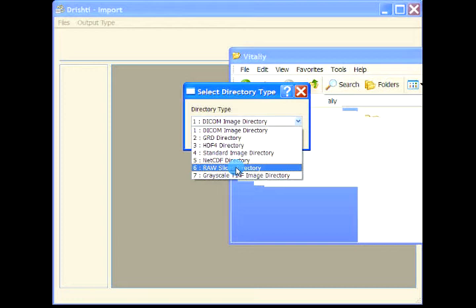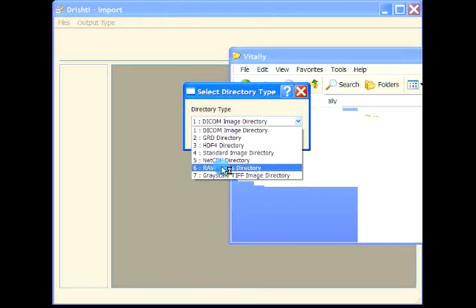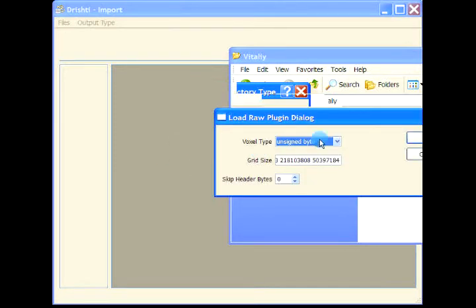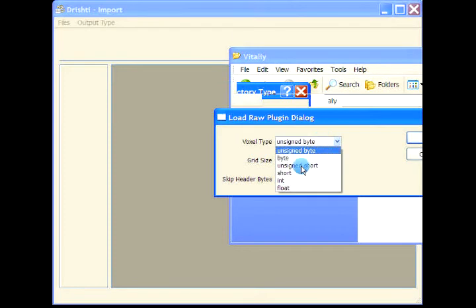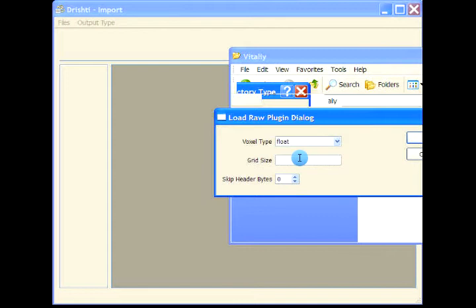Based on the size of the image file, I found that you have a header of 186 bytes. I'll select raw slices directory here. Your voxel type is float. This will be garbage right now, so delete that. Your grid size is 800 by 800 and header size is 186 bytes.